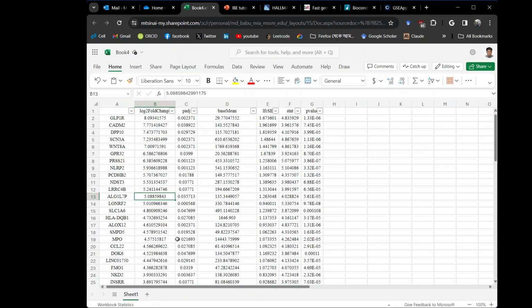Now, the suggestion is always to run this on the filtered and p-value adjusted data set to avoid any further conflict, if later on you are running something that's not actually significant. So just avoid that and first do the analysis and get your differentially expressed, statistically significant list of genes with the log fold change.